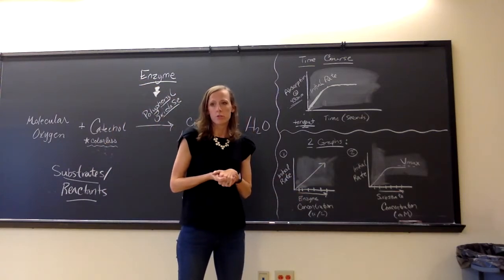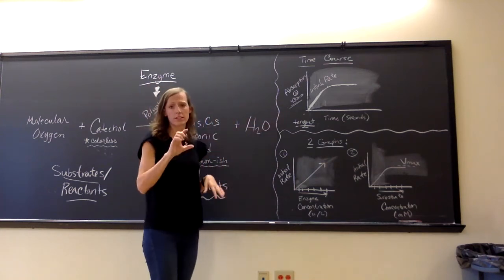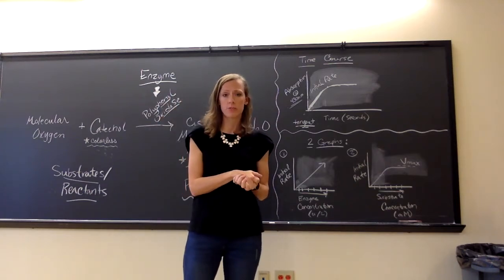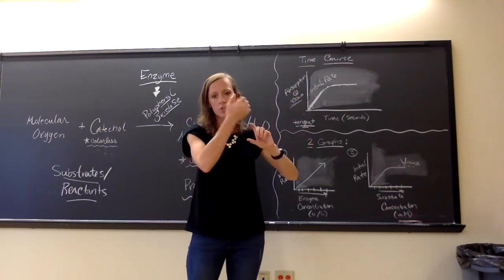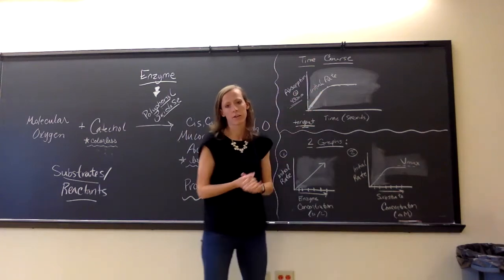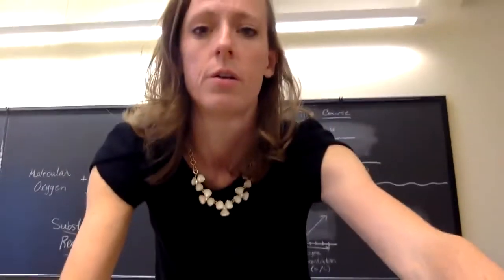One thing I want to stress is that for the students who are actively doing this in lab, you do have to be relatively quick when you mix the reaction and put it into the spectrophotometer so that you don't miss the initial rate. Okay? If you get it in too late, if you take too much time pipetting, you've already missed the peak rate of the reaction. So now I'm going to take you over to the spectrophotometer where we are going to watch this happen.